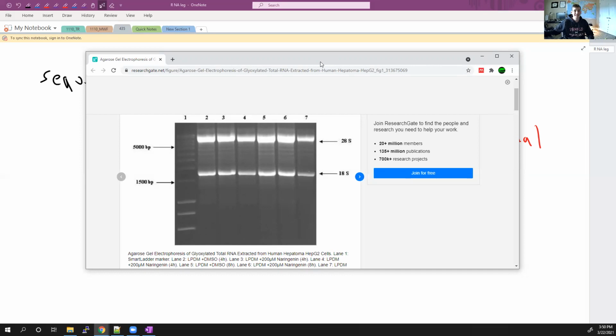Whenever you extract DNA, you'll just see a single band near the well. It's going to be big and heavy, like 100 kilobase fragments. But when you isolate RNA, you'll have two bands form: a really thick band for the heavier weight molecules, and a smaller, thinner band of the lower weight molecules. Both of these are ribosomal RNAs, the 28S and the 18S.